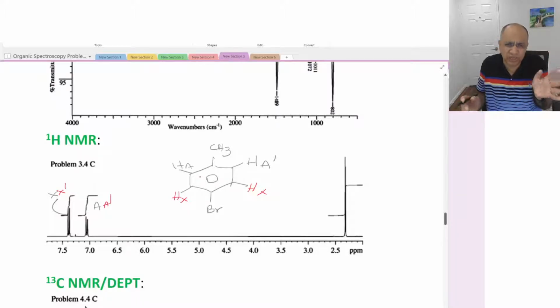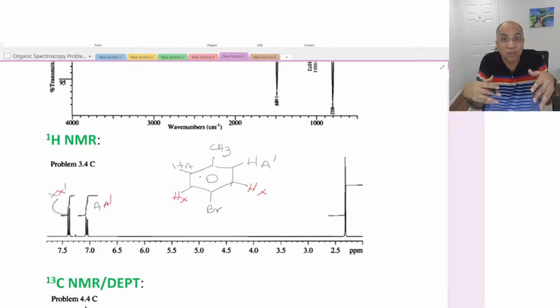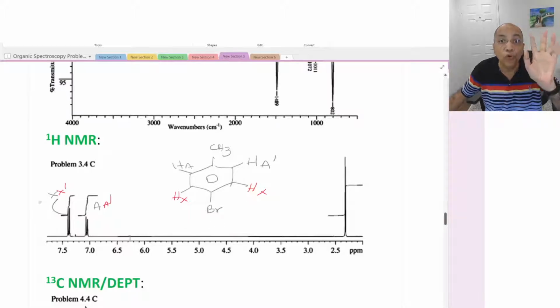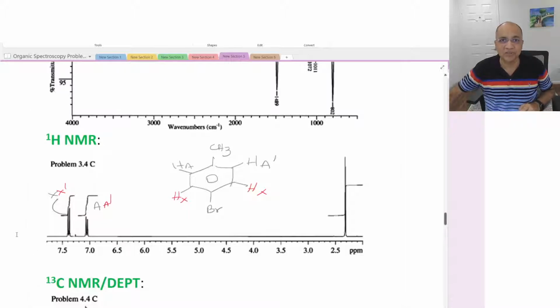And if you say that CH peaks can be very close and can give an overlapping complex multiplet in the proton NMR, you can verify that. You can get rid of that confusion from carbon 13 NMR. It would give 4 CH carbon peaks. That would also be supported by the DEPT-90 giving you 4 CH peaks.